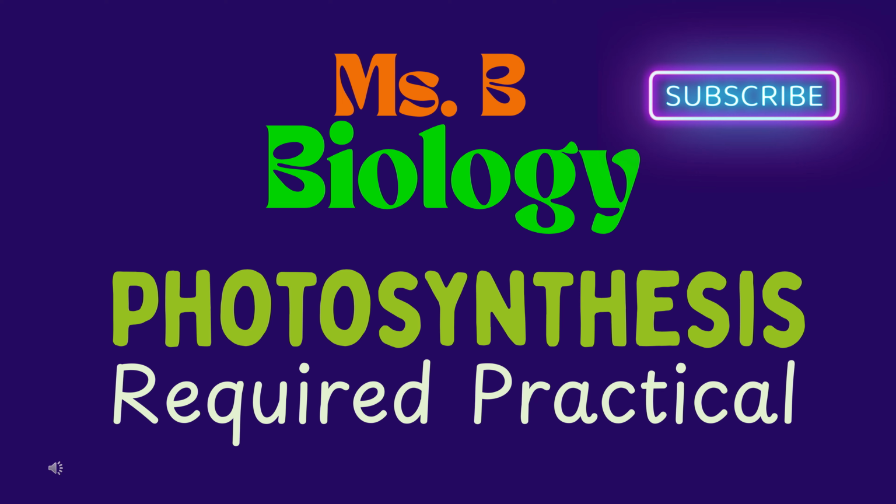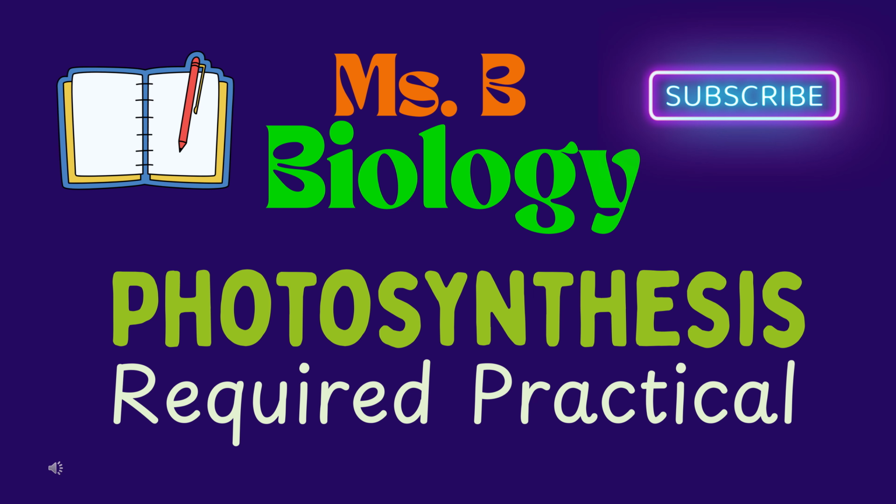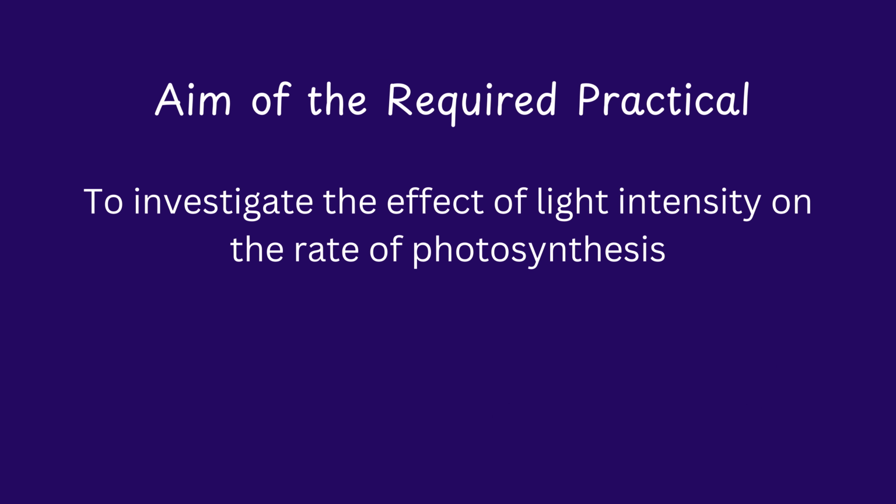This is a revision lesson on the required practical for photosynthesis. So grab your book and grab your pen and let us begin. The aim of the required practical is to investigate the effect of light intensity on the rate of photosynthesis.